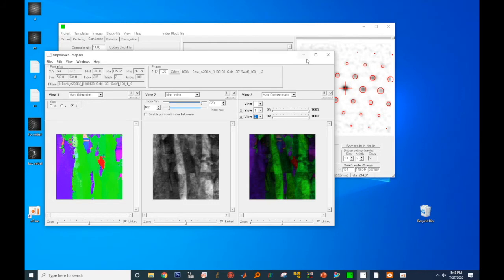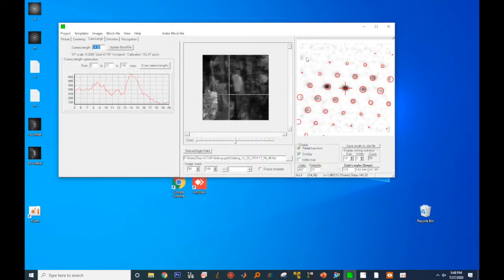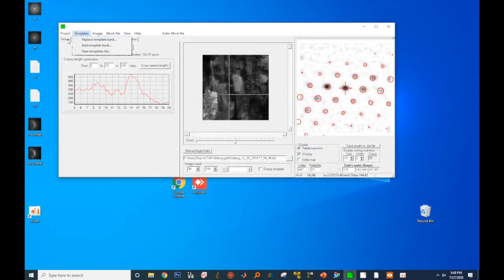Before wrapping up today's video, I want to show you two more techniques to visualize PED data. To do that, we'll exit the map viewer and go back to the index software.